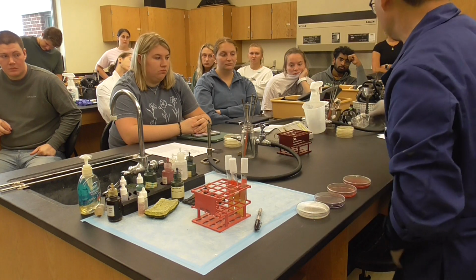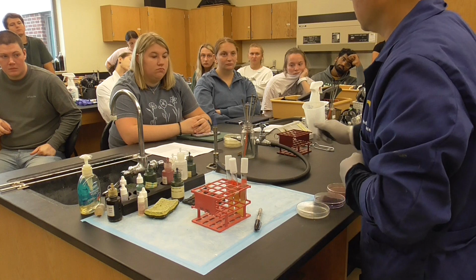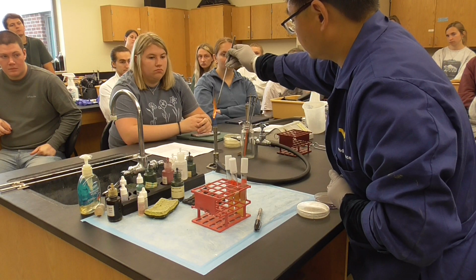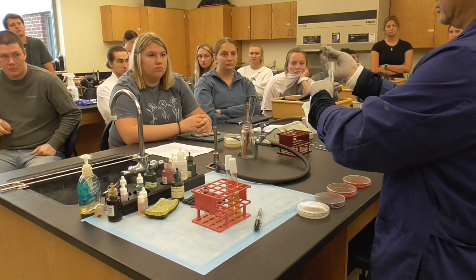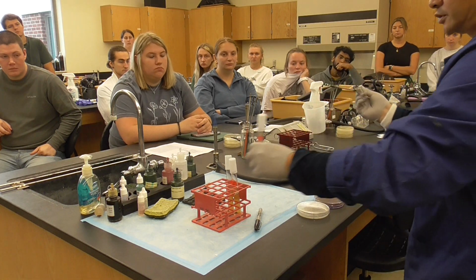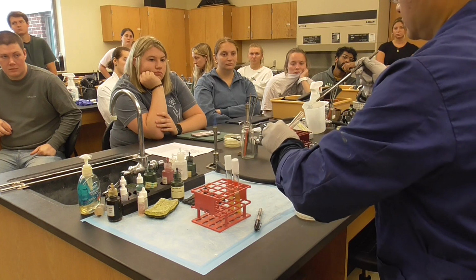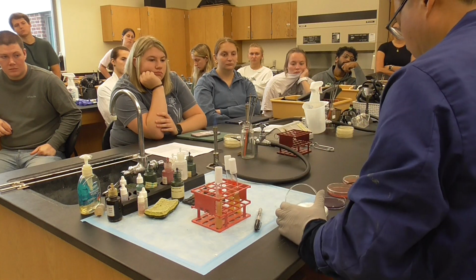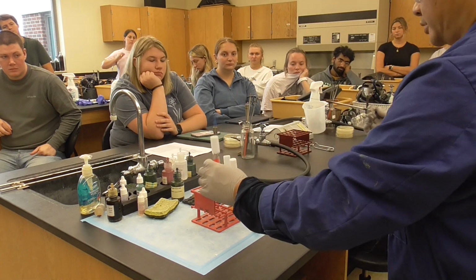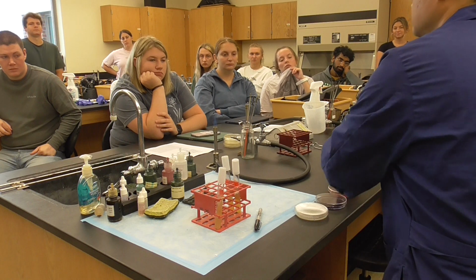Now, what you do? Turn on the Bunsen burner. Okay, loop. Make sure it's straight. Flame. Okay? Flame the loop, very important. Okay, let's do E. coli first. Flame, cool down. We're going to pick some bacteria, okay? What we do? Go here, E. coli is right here. Very gentle. Take a little bit. Right here. The last one should be good. So, just do it. That's E. coli.